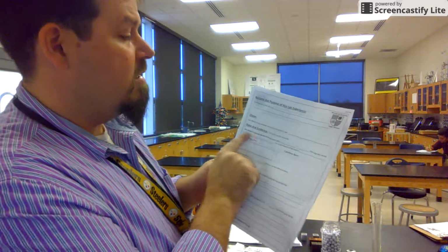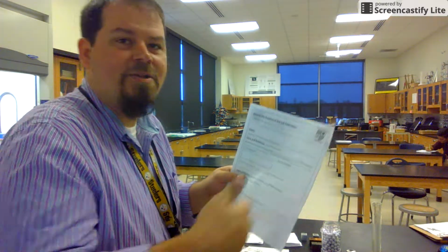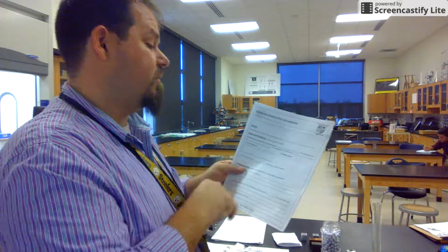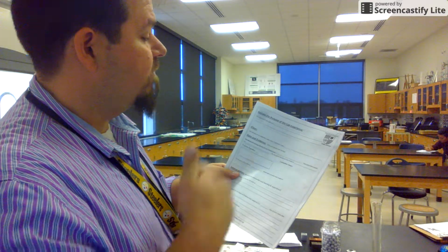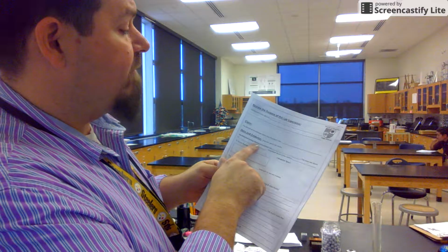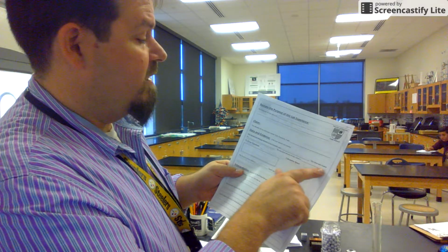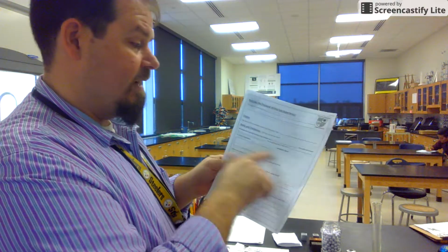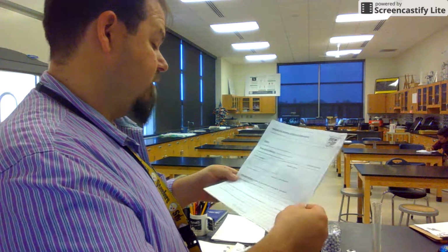Data and evidence: fill in the blanks. Notice these things are kind of pointing you in the right direction so that as you get comfortable, I can not put so many words in. You can start to fill these things in yourself in future labs. The measured average density of my unknown was blank. This value is closest to blank. The accepted value is blank. Calculate your percent error.